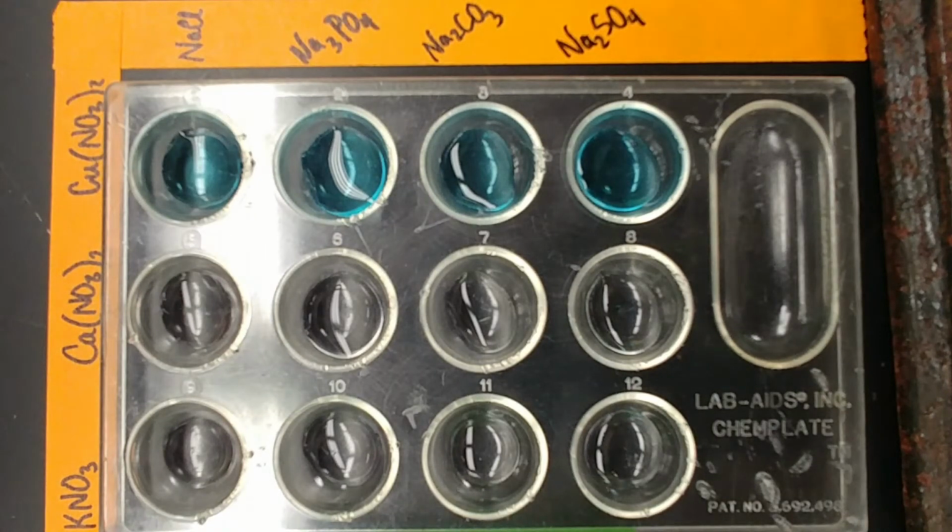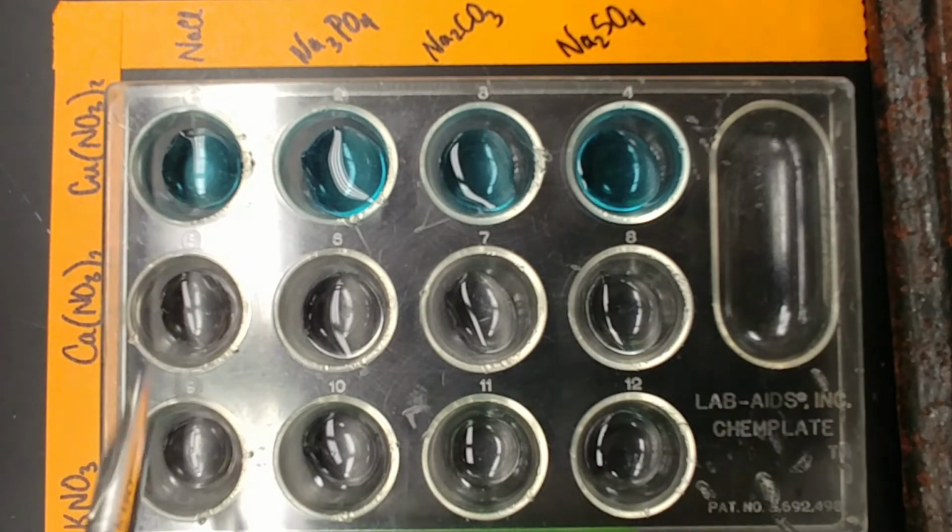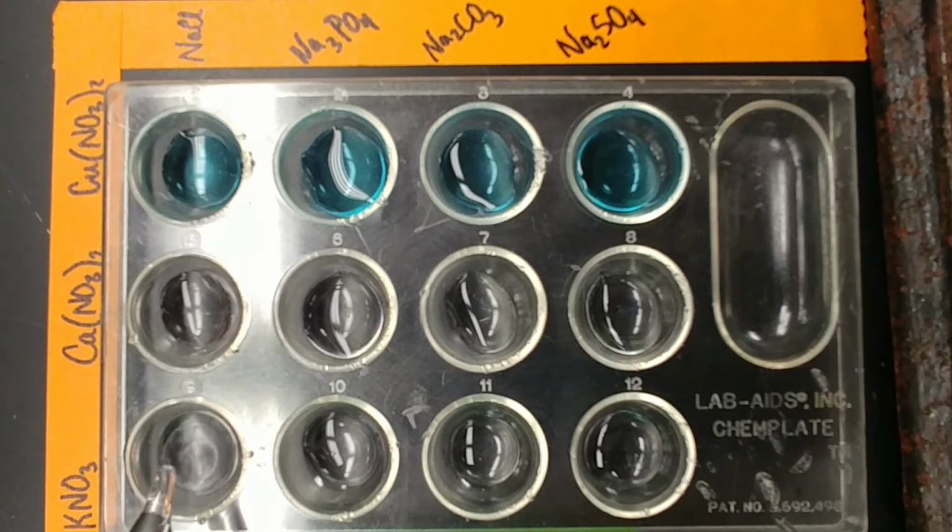All right, and now we're going to start our mixes. Now it's very important that when you do this, you do not contaminate the tip. And so you make sure that you do not touch the tip of the pipette to the solution that's already in the well. So I'm going to add the sodium chloride to each of the plates going across. So just a couple of drops.